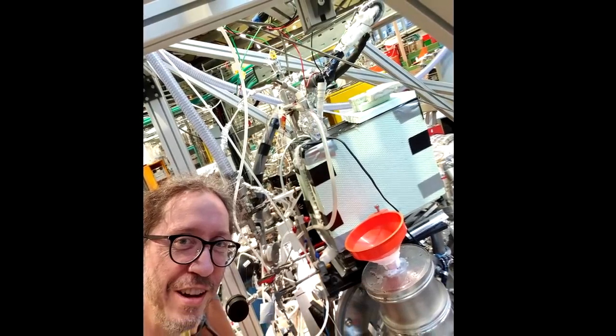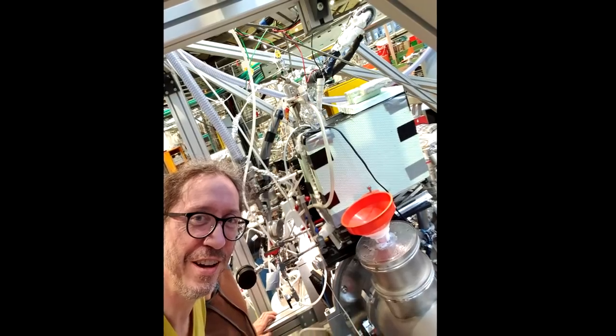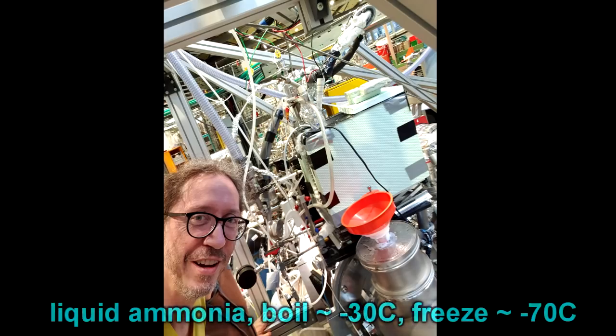Let me just tell you a little bit about ammonia. It's a really horrible smelling gas that liquefies at about minus 30 degrees Celsius to make a really horrible liquid to work with. Why work with it? Well it turns out it's actually quite interesting chemically because of its similarities to water and that it's a very strongly hydrogen bonded liquid.